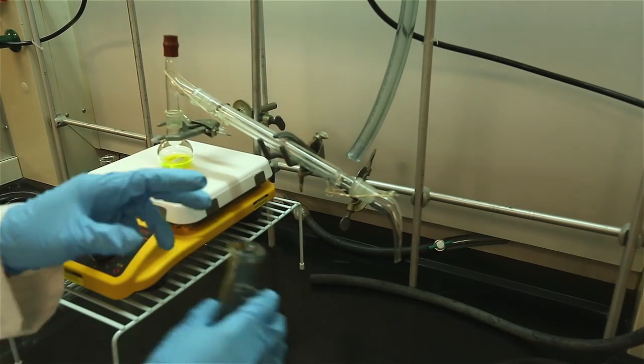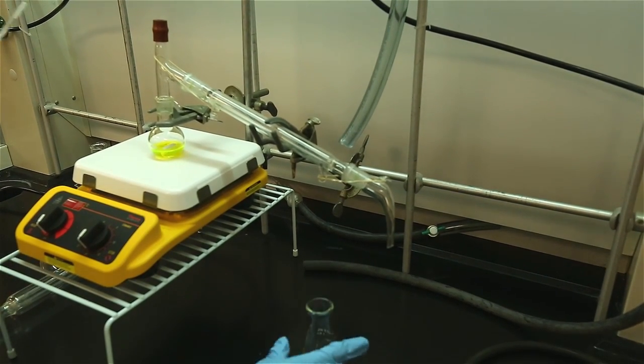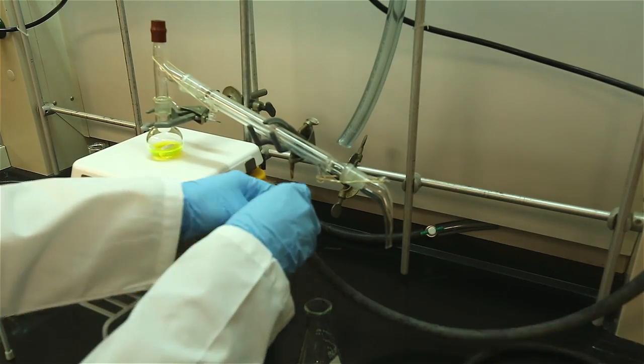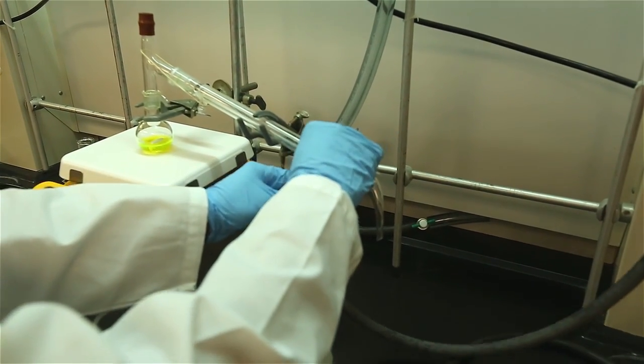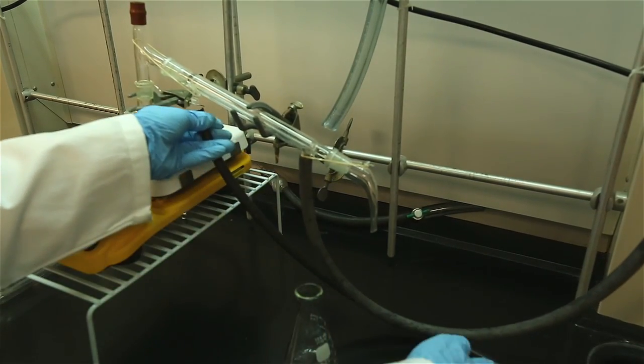Be sure to add a boiling aid to eliminate violent splashes caused by bubbling of a superheated solution known as bumping. If you forgot to add in a boiling aid, remove the solution from heat and allow it to cool to room temperature before adding the boiling aid.